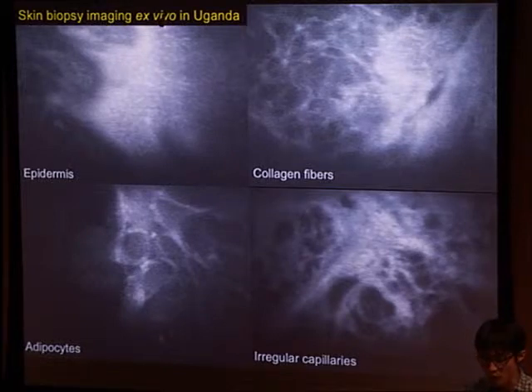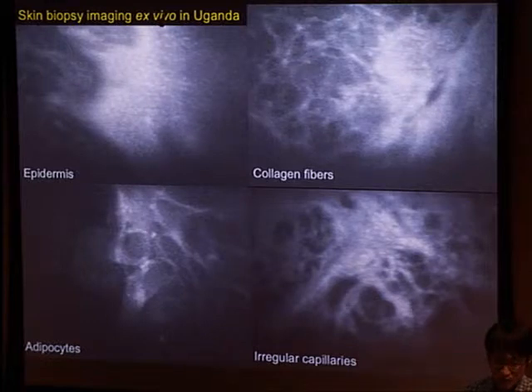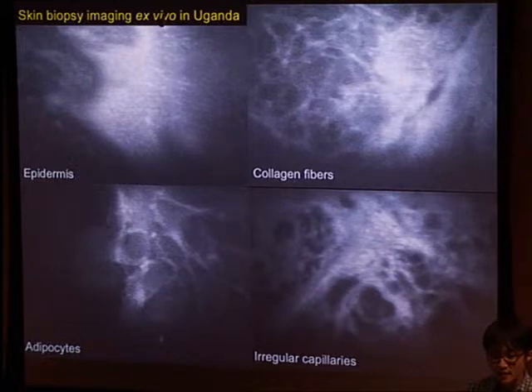Right, true. So one of the reasons to use this particular wavelength is that the field of view size, or the image size that we can cover with our approach, is determined by the bandwidth of the source. The particular LED that I have used is 80 nanometer, and that's by far the largest among the commercially available low cost LED sources.